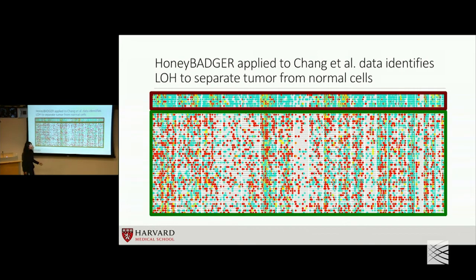And what was really cool is then we were able to do whole exome sequencing on the tumor and show that this is a copy-neutral LOH. So the expression-based karyotyping showed that this was a copy-neutral region, which is correct. But the allele-based approach was able to see that even though this was copy-neutral, there was still something strange about the allelic imbalance. And combined, we can then start being able to distinguish whether this is actually a copy-neutral LOH.